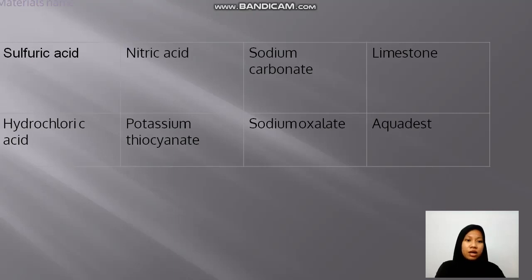Materials: sulfuric acid, nitric acid, sodium carbonate, limestone, hydrochloric acid, potassium thiocyanate, sodium oxalate, and aquades.